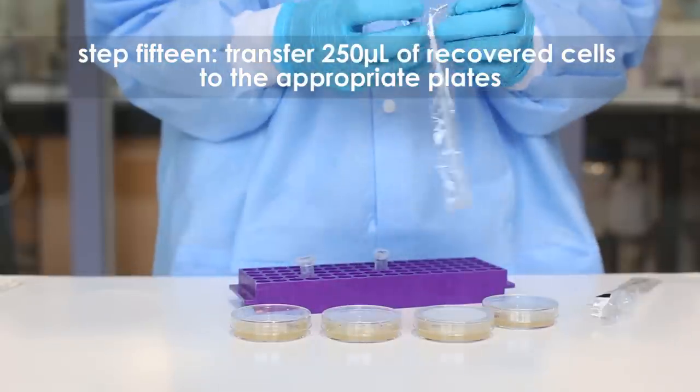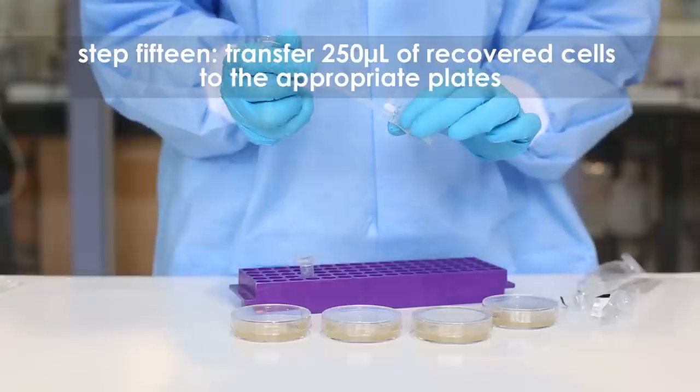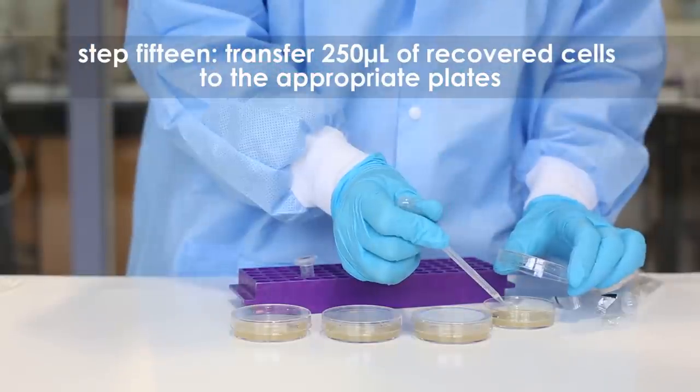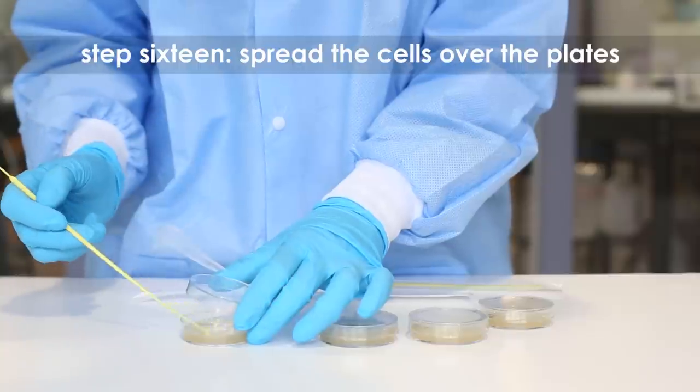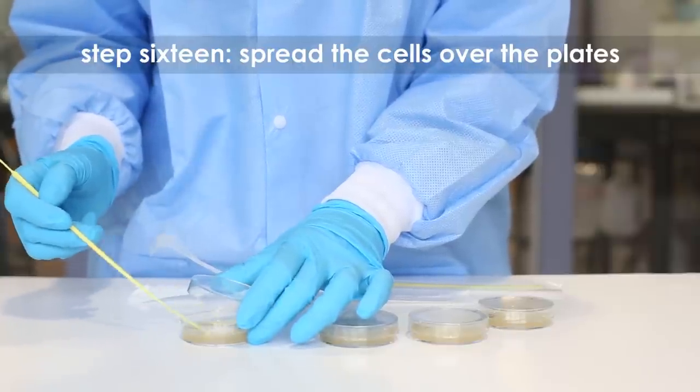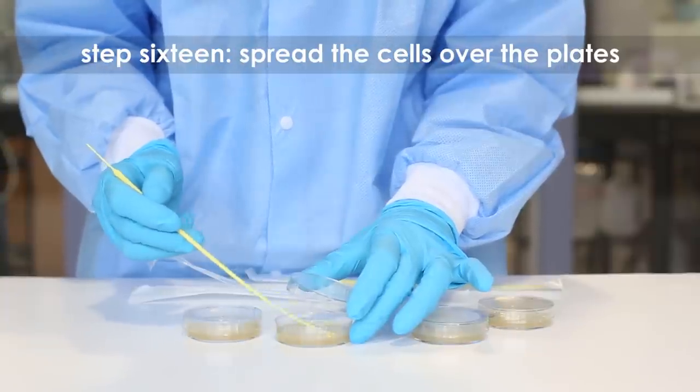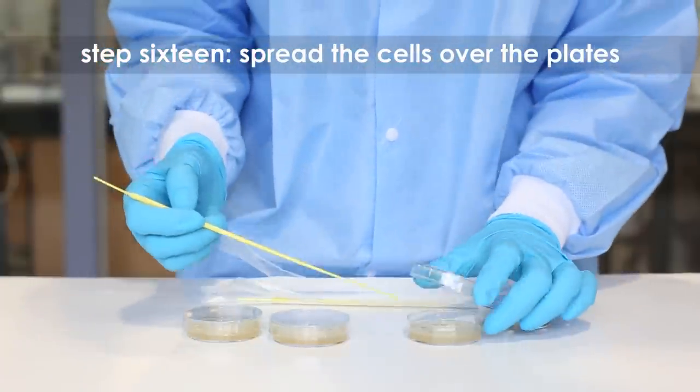Make sure to use different pipettes for the plus DNA and minus DNA samples. Step sixteen: spread the cells over the entire surface of the plate with a sterile inoculating loop. Cover the plates.